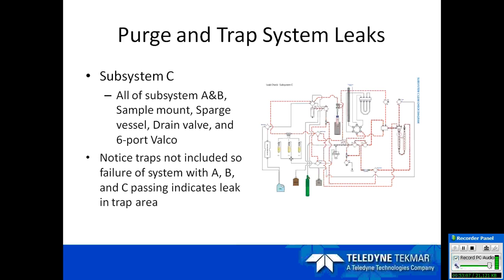So when you're talking about the Atomx, we've now gone from 4 systems down to 3. The entire time Tyler's talked about the mass spec, the GC, the concentrator, and the autosampler. When we are talking about the Atomx, you're talking about a concentrator and an autosampler all in one. And so you also have something now that can do waters and soils and methanol extractions. So this entire leak check and benchmark is a more methodical approach to helping you find the leak than trying to figure out where all these are in the inner workings. It's made it a lot easier for troubleshooting to have everything all in one system. And so taking this methodical approach will help you get through that.